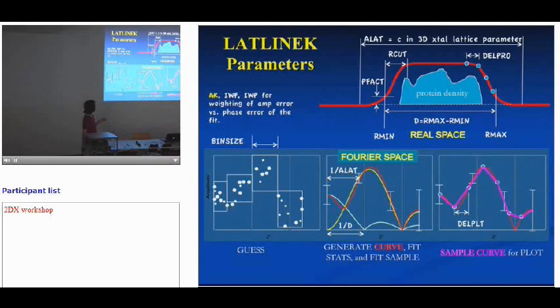And to generate the curve, we need to know two things. Actually, they're separate. There is 1/d, which is your envelope function, so you know where it dips to 0.